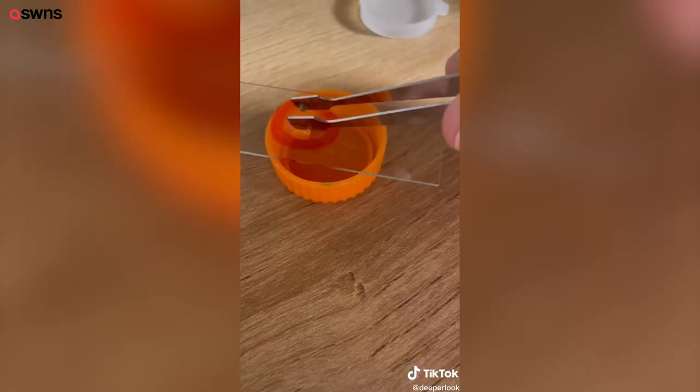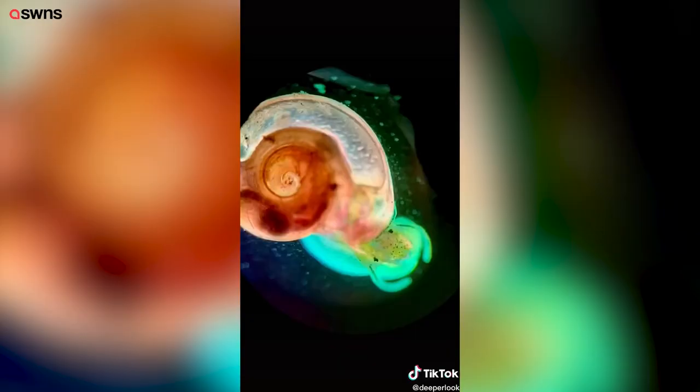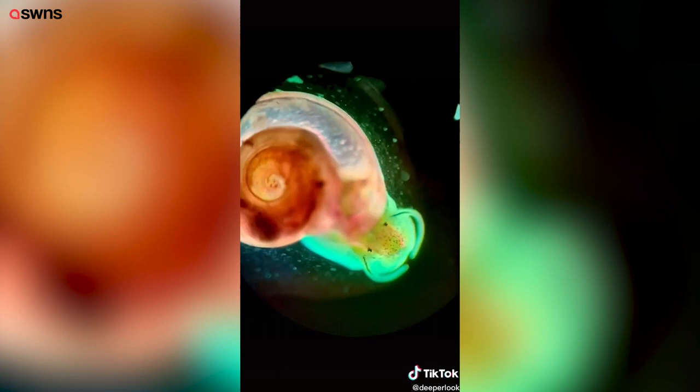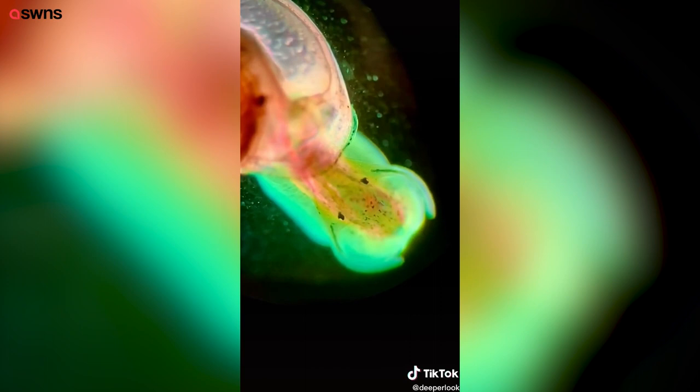These are ram's horn snails and they're about two to five millimeters wide. I threw them under the microscope to use with polarized light and a pleochroic plate — the same technique I used in my mosquito larvae video. We can see all of the different structures inside of the snails because they interact with light differently. I'm not making these snails fluorescent or anything, though that would be a really cool genetic experiment. The flesh of these snails just interacts with the polarity of light in an interesting way.